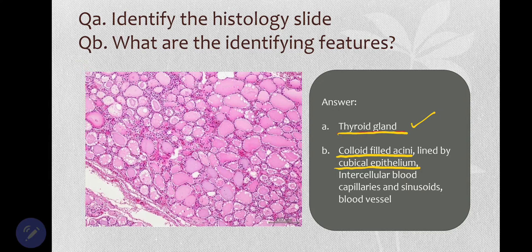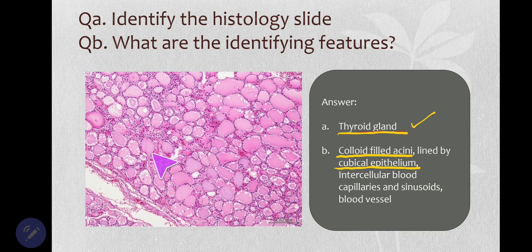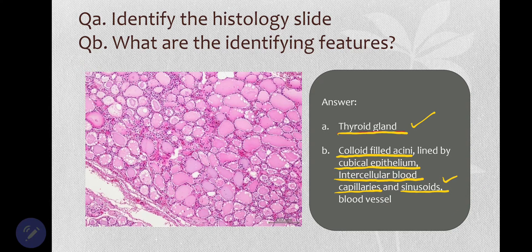Another very important identifying feature relates to endocrine glands: since they are ductless glands, they have blood capillary plexuses surrounding the acini, as well as blood-filled sinusoids. These intercellular blood capillaries and sinusoids are key identifying features — one, two, three — and of course you can also see a blood vessel here.